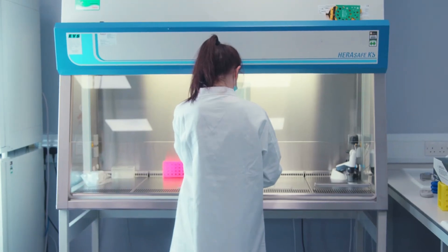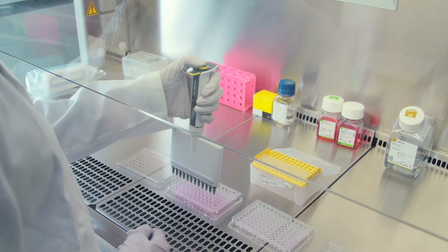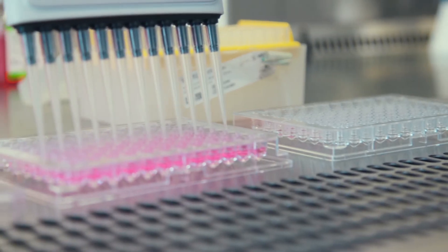Let me show you how to set up and perform a type and titer assay using the IQ3. The total protocol time for this assay is approximately one and a half hours, and the actual hands-on time is only around 15 minutes, meaning this workflow is extremely quick and low maintenance.